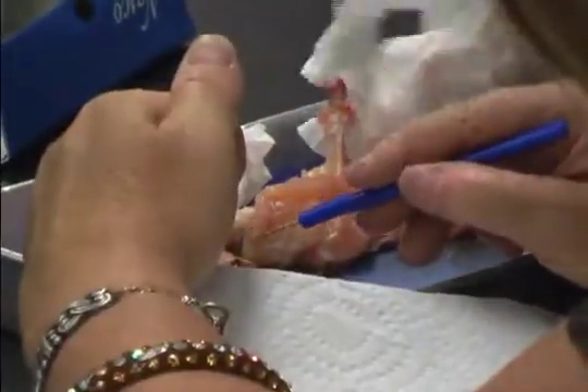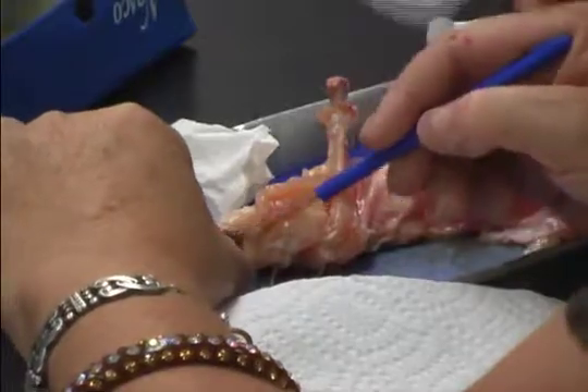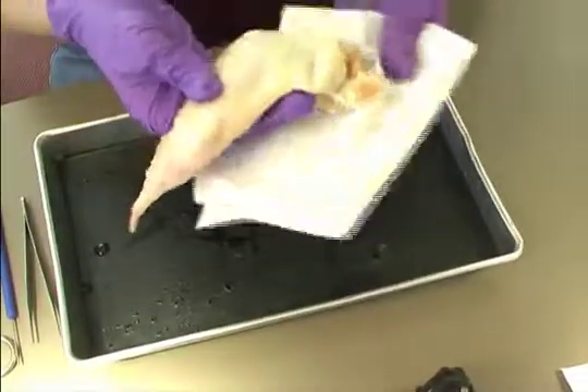It is important to review the safety practices before starting and use safety precautions during the investigation. After students receive a chicken wing, have them rinse the wing and pat dry before placing it in the dissection tray.